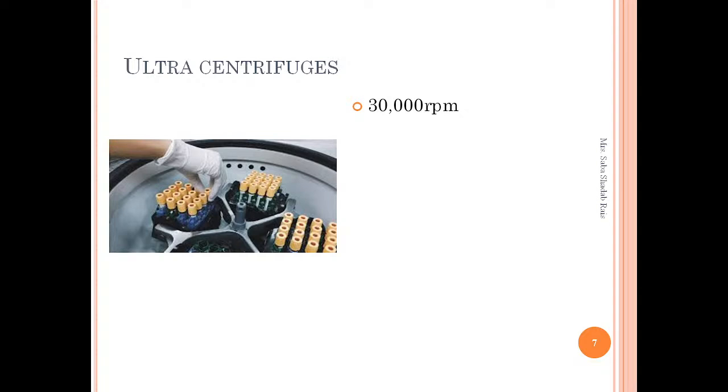So for that reason, we need to create a high quality refrigeration system where the biological sample will not be heated, because when the protein is heated, because of that heat the protein gets denatured, and lots of properties are degraded. So for that reason, if you want to harvest live cells, definitely the system should be very cold, so that no harm will happen to the cells.